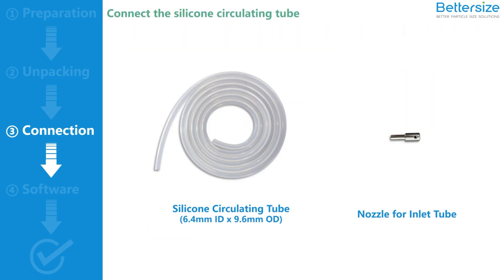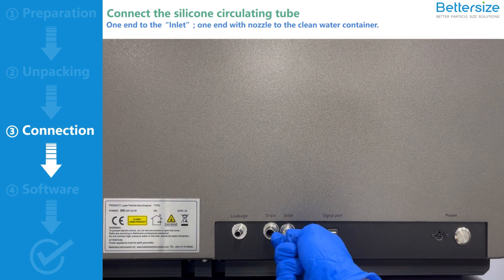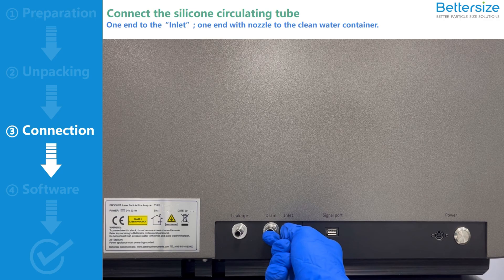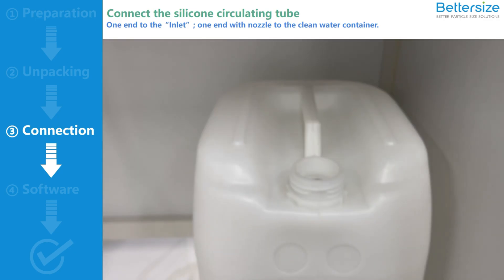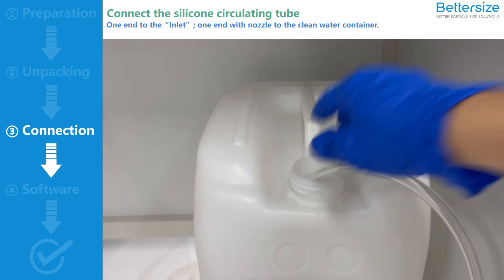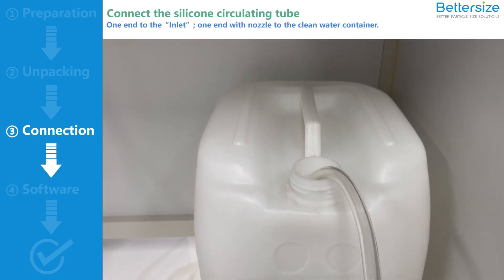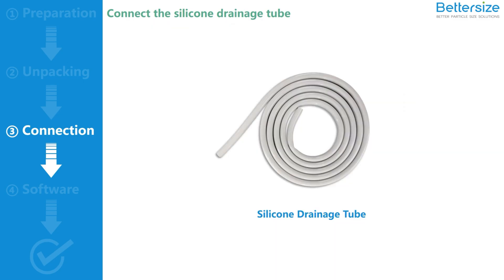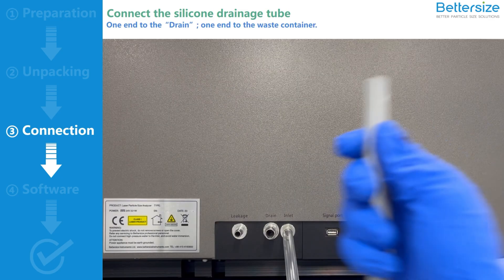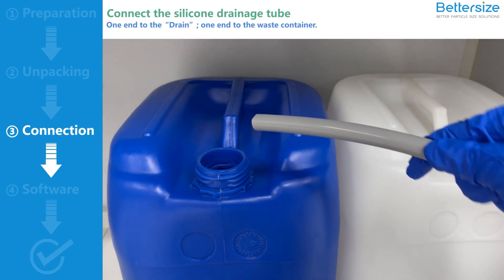Connect the silicon circulating tube first. Connect one end to the inlet port of the Bettersizer ST. Insert the nozzle to the other end and place it into the container filled with clean water. Then, connect the silicon drainage tube. Connect one end to the drainage port of the Bettersizer ST, and put the other end into the waste container.